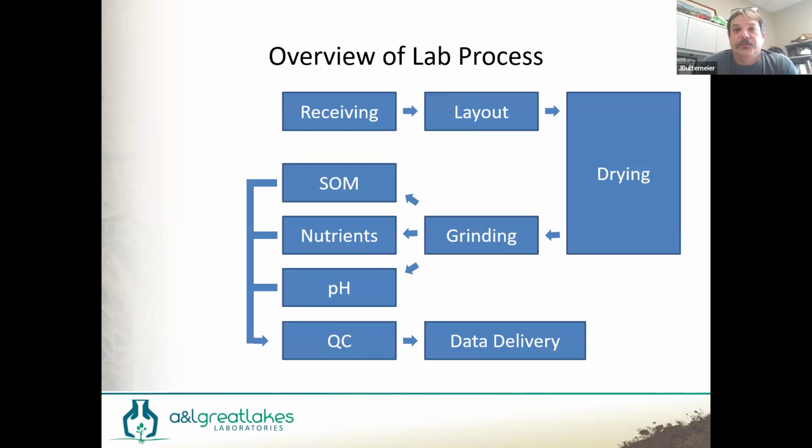And those samples are dried per specifications, and we'll get into that a little bit later, what those specifications are and how they're developed. But we cannot dry those soils over 104 degrees Fahrenheit, or we adjust the potassium levels. And so there's rules and guidelines. Again, like I said, we'll get into those in a moment, but there's rules and guidelines how to do it.